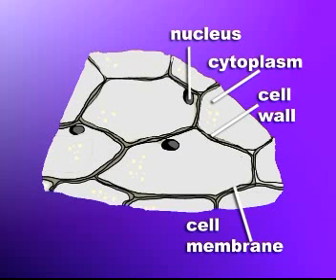When doing a scientific drawing, the idea is to represent the different parts clearly, not to make an artistic impression of what you see. So, please do not shade the drawing. Also, when you label the parts, firstly, make sure that your label lines do not cross. Then, write the label next to the line. Teacher, please see that all students draw the diagram neatly.